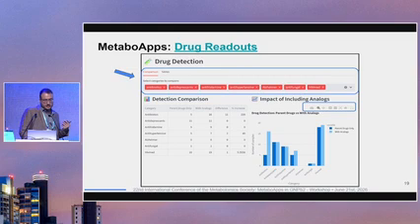It can give you some ideas on whether the method you're working with is maybe not ionizing some of those compounds, or, if you're working with brain samples, for example, some of the compounds are not crossing the blood-brain barrier and some are, and that might be one of the reasons you're seeing some metabolites or some analogs and maybe not the parent drug, or the other way around. And as I said before, on the charts, the bar charts or the Sankey plots, you're always going to have the options to expand and to download these charts.